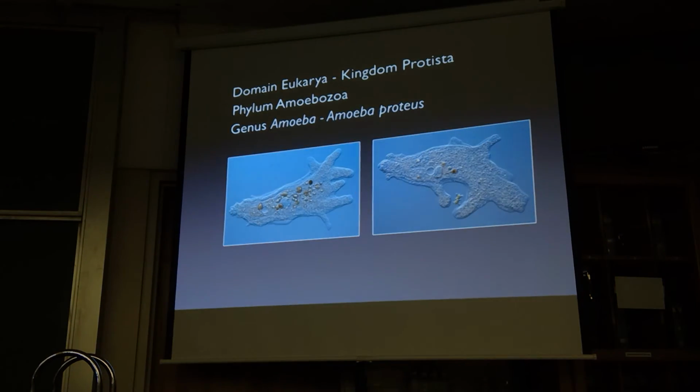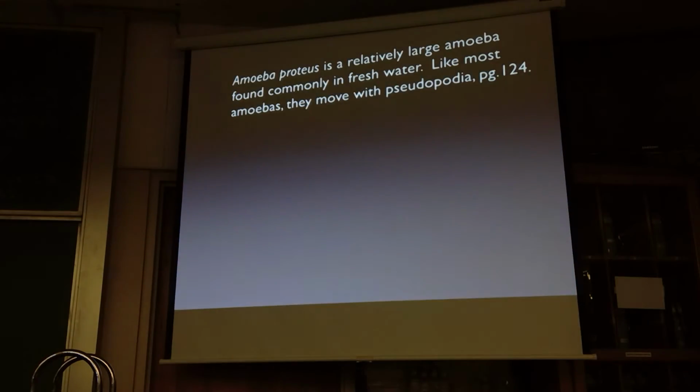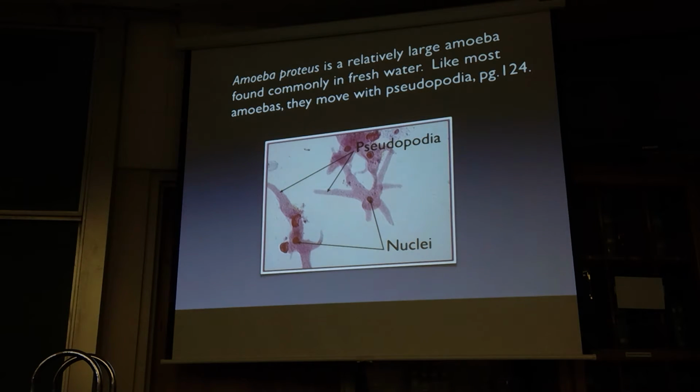Our prepared slides of amoeba show them looking like that. Most of them are pink, and you can see them in a variety of different shapes. The nucleus is stained a slightly darker pink. However, you should know that I have a prepared slide of amoeba that has green ones and yellow ones and pink ones and brown ones and purple ones. How do they come like that?